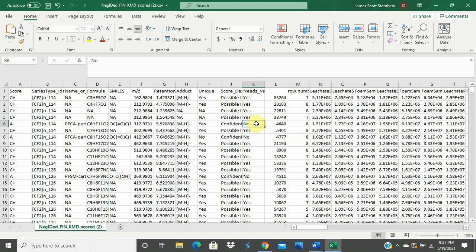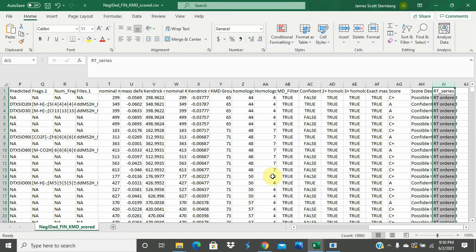Note that there are minor differences, such as straight-chained versus branched isomers, that cannot be determined using MS-MS evidence in many cases, and therefore the structure is correct in terms of number of repeating units in class, but not exact structure. This output table that we just went over shows information for one repeating unit.